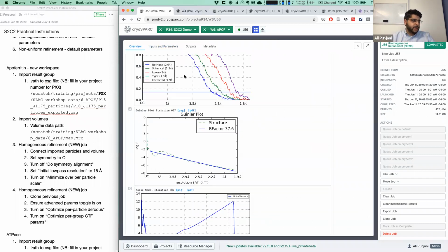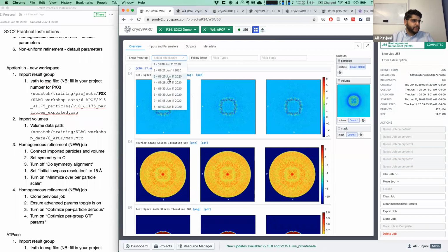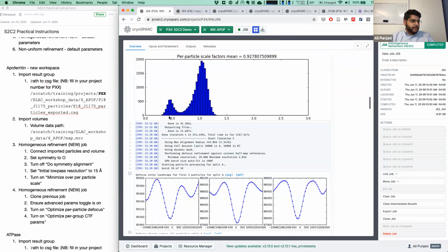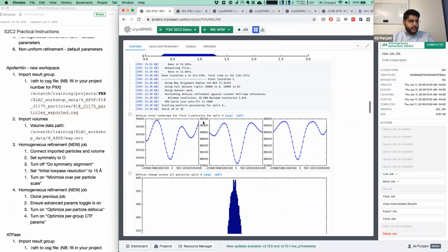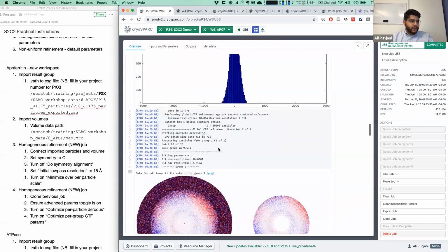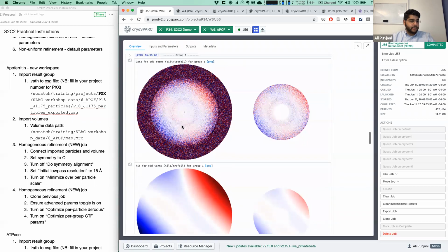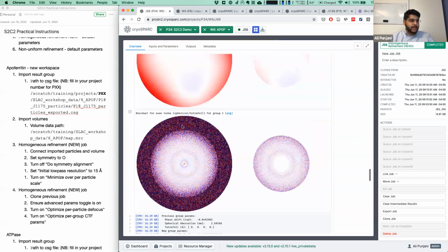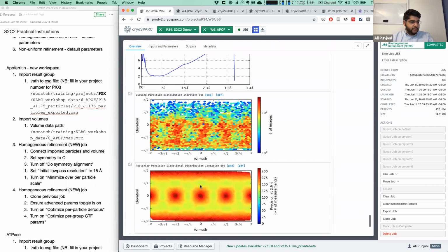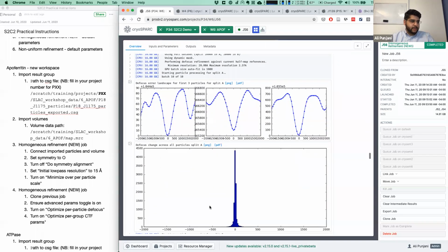And that means that in this job, if we look back a few iterations, at iteration 5, for example, we are actually doing the same CTF refinement at this point in this refinement cycle. So at iteration 5, we start refining the CTF. The defocus values are updated, the astigmatism and other higher order aberrations are estimated and corrected. And then we do another round of refinement to update the angles and poses of all the particles. And then we re-estimate all the defocus values and update them again.